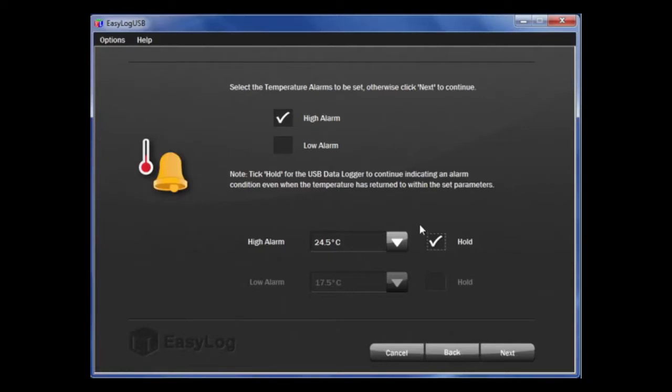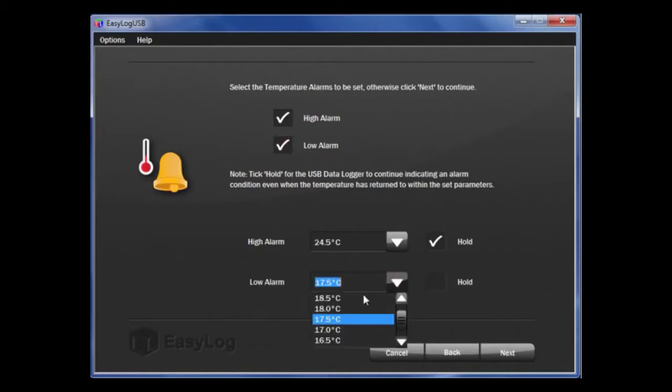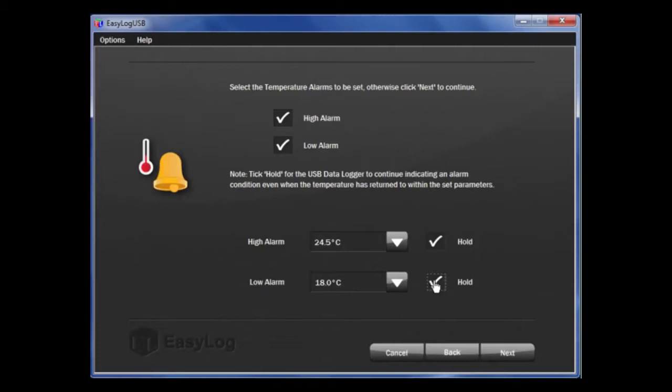I will do the same for the low alarm and select the appropriate temperatures. Then select Hold for both of them. If you wish to not set up temperature alarms, leave the boxes unticked and click Next.